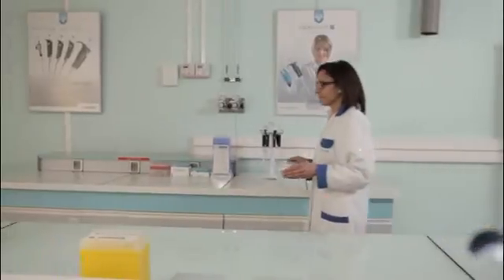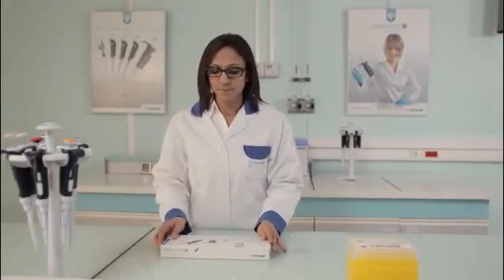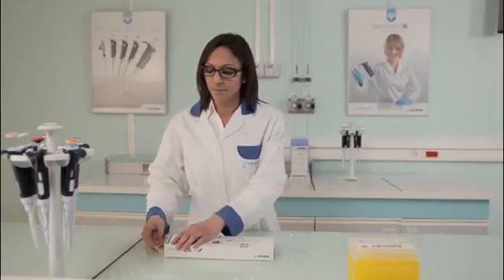Good results and great comfort are essential needs for daily pipetting. Let's find out how the PipetMan L can bring all these benefits to your lab.